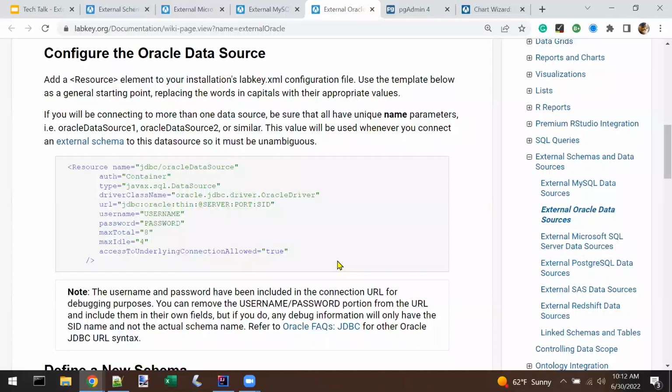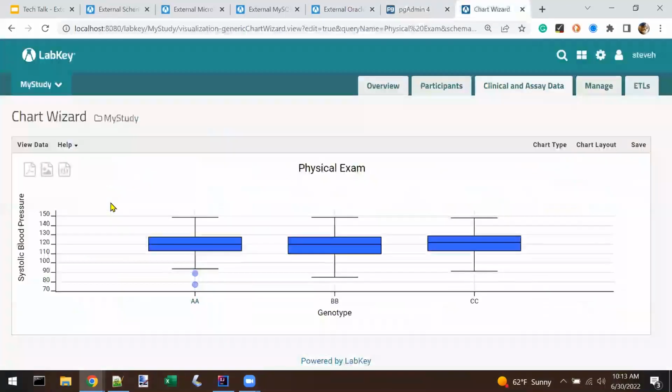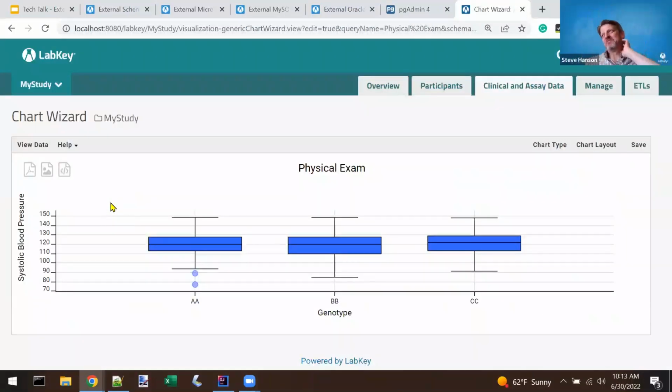You can use that for Excel, KNIME, or, what's that, the thing everyone loves, the guys over in Fremont. Tableau. Tableau, thank you. That is a great way to connect to external reporting services.